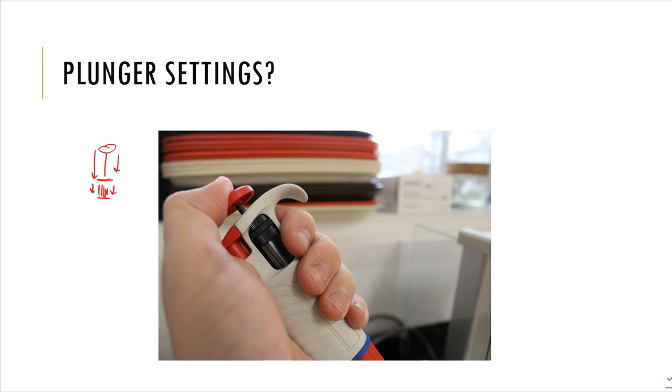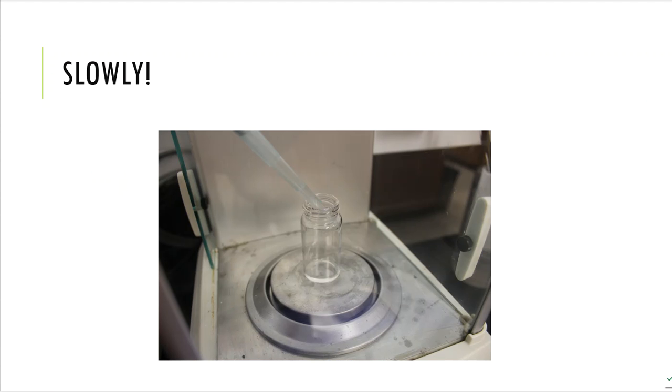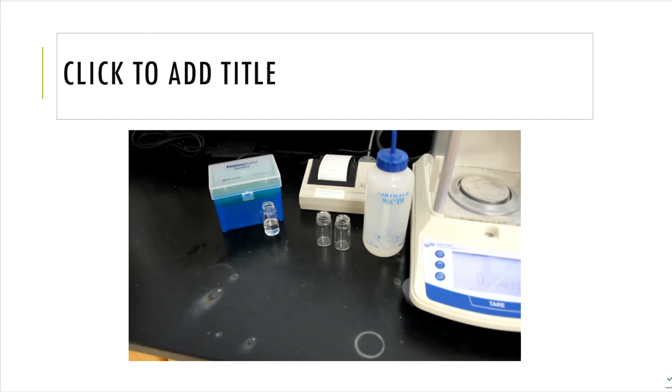And that poof of air will push out any residual stuff that still might be present in my micropipette tip. So I push it down to the first plunger stop. The majority of my liquid will be gone, and then I push it down a little bit extra, and that will force a little puff of air to go through the tip and push everything out that needs to come out. All right, so here's a video that basically shows you the setup that I'm getting ready to do.